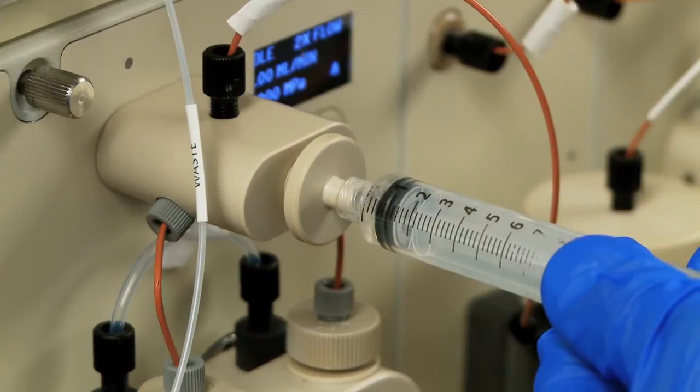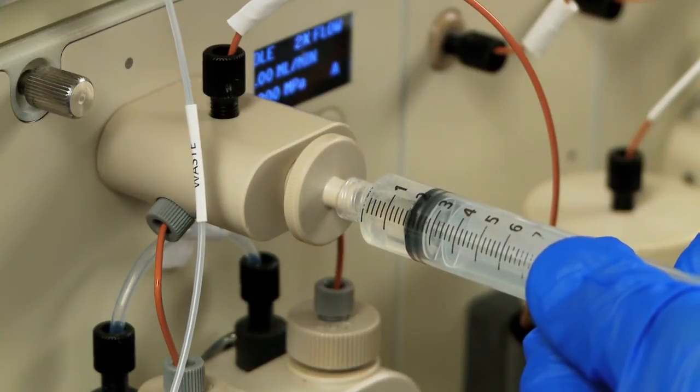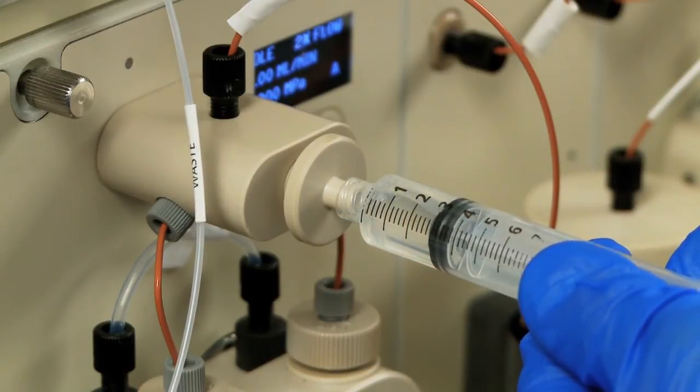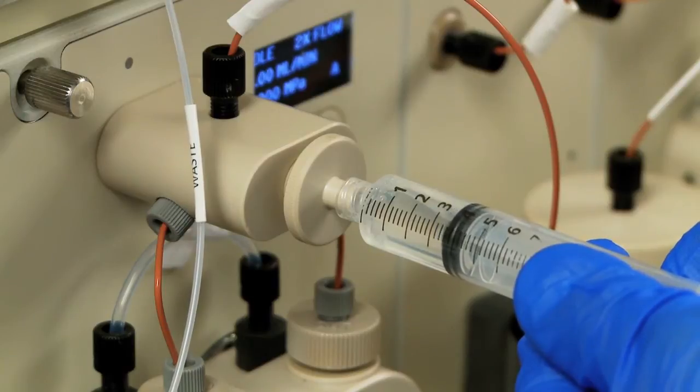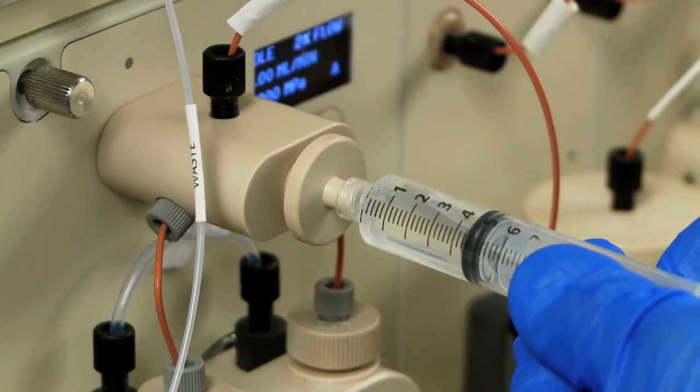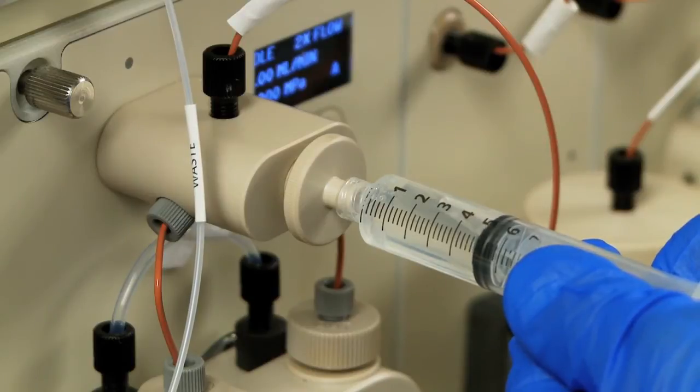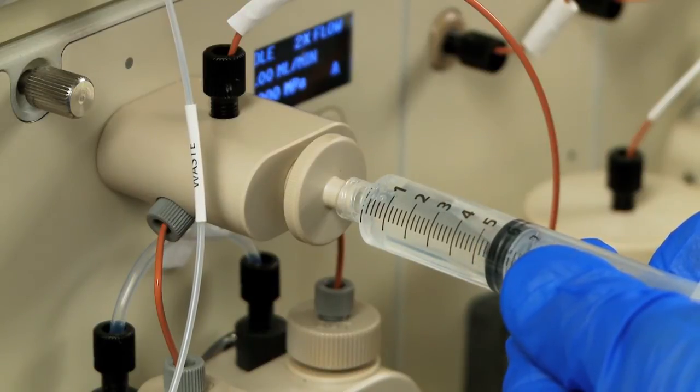Pull back on the plunger until a steady stream of liquid is observed and no more bubbles appear. You should withdraw approximately 10 milliliters of liquid. You may want to do this a second time to ensure the lines are completely filled with buffer.